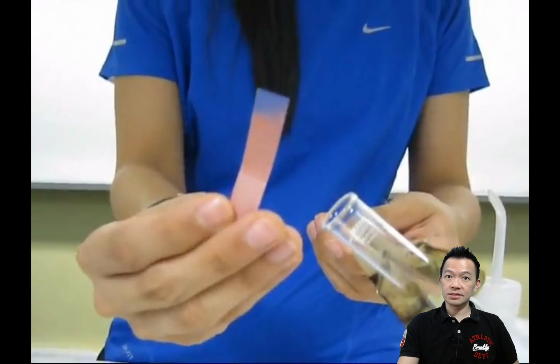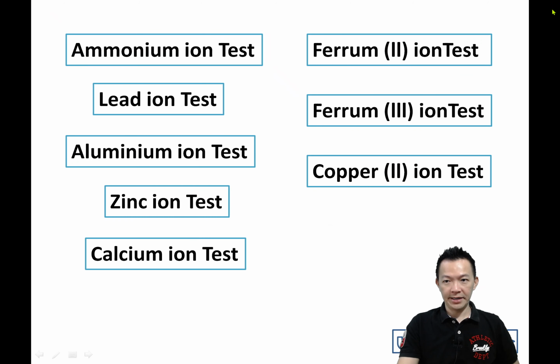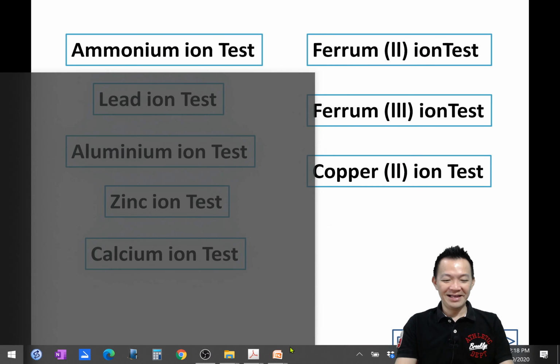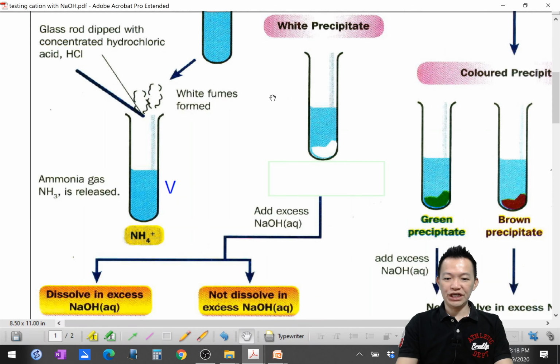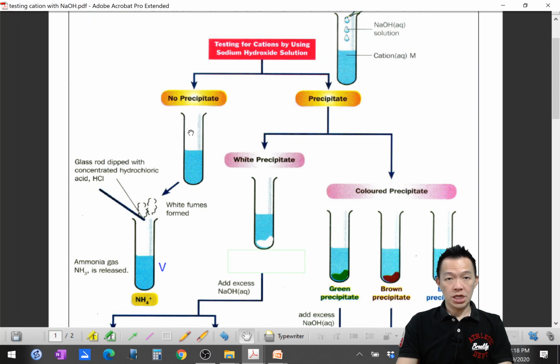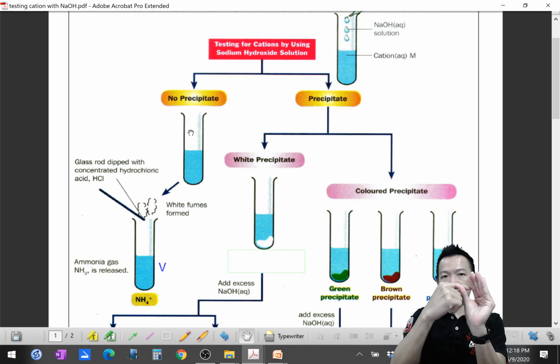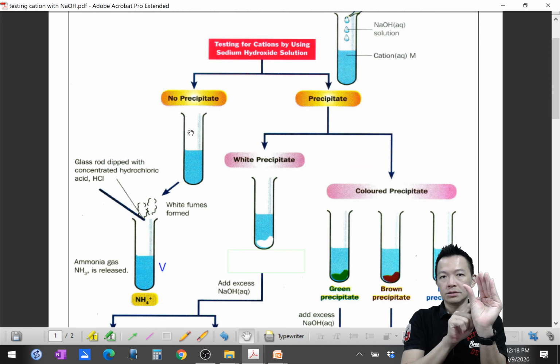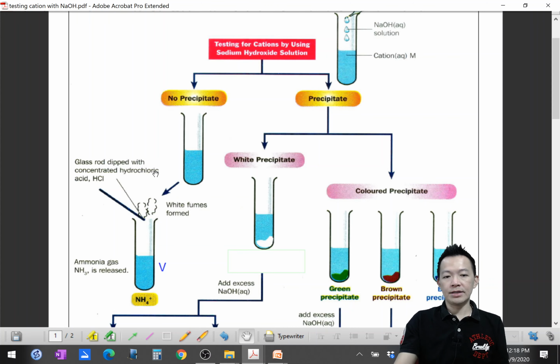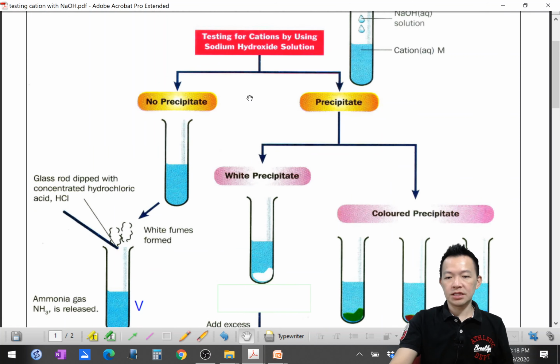We have more than 20 tests, starting from here, and this is just the first one. Okay, so where are you? Prepare the salt solution. Add the sodium hydroxide solution, no precipitate is formed. So I make the conclusion, this is the ammonium cation. The cation inside is called ammonium. Okay, and now I go to the second part.